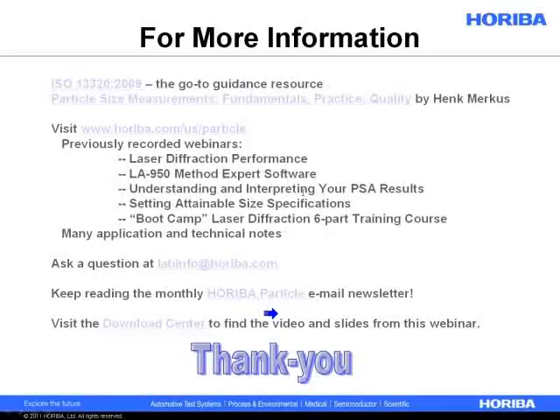So Jagdish is asking, if there are nano-sized and micron-sized particles present simultaneously, can laser diffraction give a reliable distribution of these? In other words, is there a weighting you have to do? That's an excellent question. And the answer I'd give is yes, laser diffraction can give you a reliable distribution, but as I was just saying, you have to remember that it's on a volume basis. So it will, in a way, weight the coarsest particles, the micron-sized particles, because it's a volume relationship, and the volume of those micron-sized particles is much, much larger than the volume of the nano-sized particles.